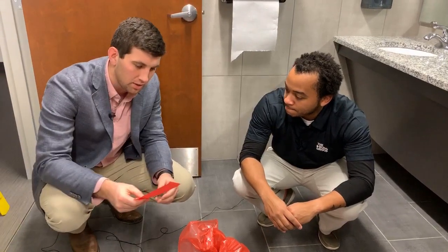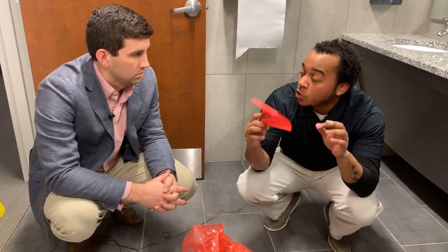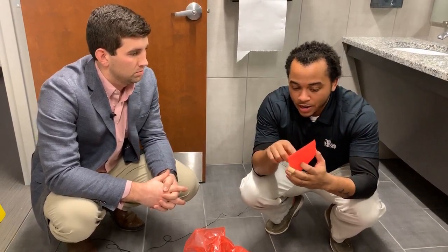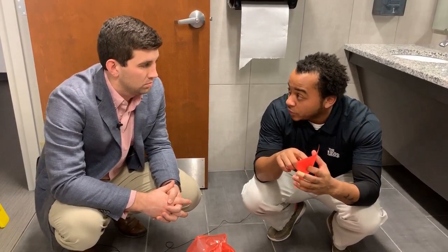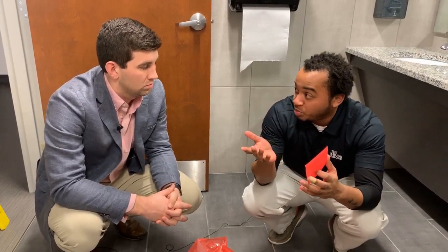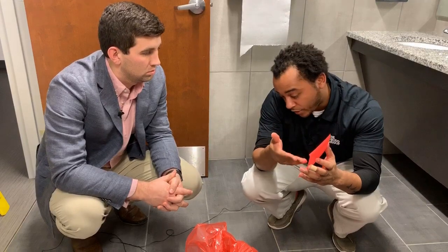I noticed in this kit that there was this little pink form. Can you tell me what this is? Yes, so the employee or the person cleaning the spill needs to record it. This is very vital, OSHA regulations. So what you're going to do is you're going to date, time, expose your employee, your name, the location, what site you're at, whether that's being at Baptist Health or wherever. Sources exposure, whether that's blood or what was exposed, whatever that might be. And then the type of spill, whether it was blood, vomit, urine, feces, or other.